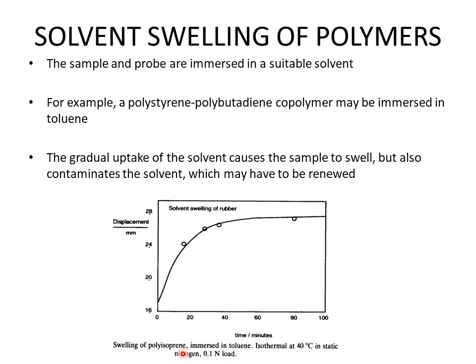The atmosphere is static nitrogen and the load is 0.1 Newton. So here we can see the swelling of the rubber, which increases and then becomes constant with the passage of time.